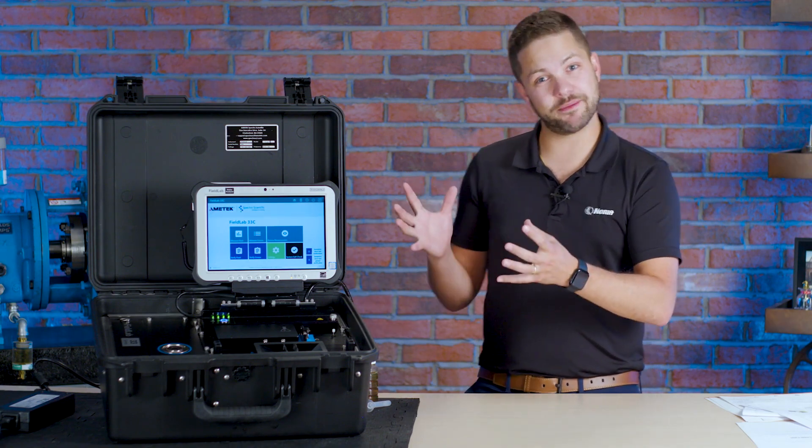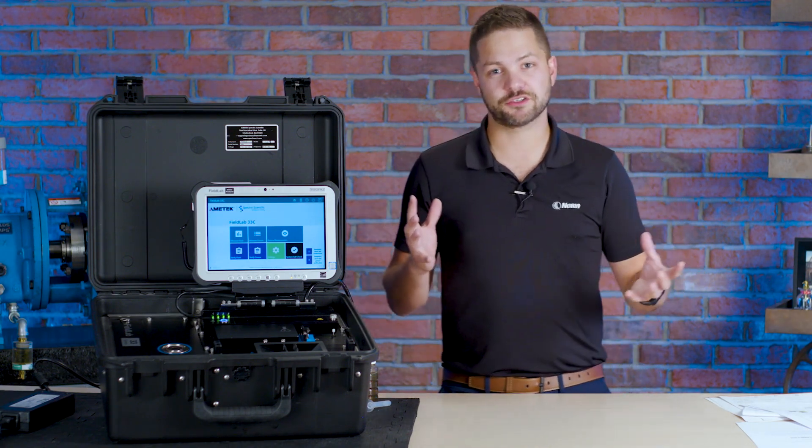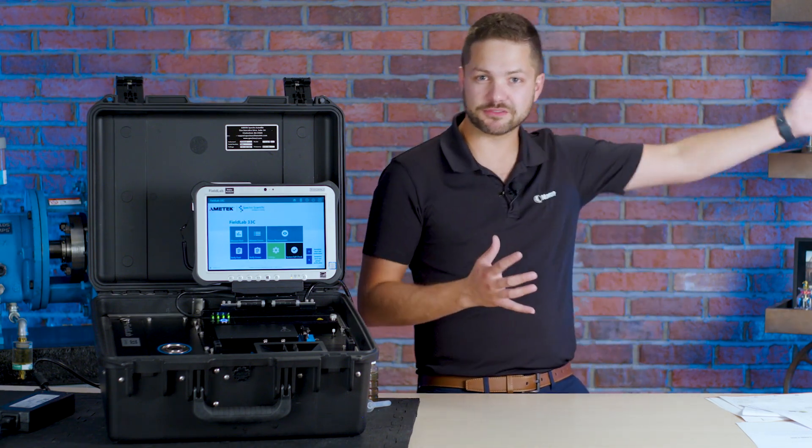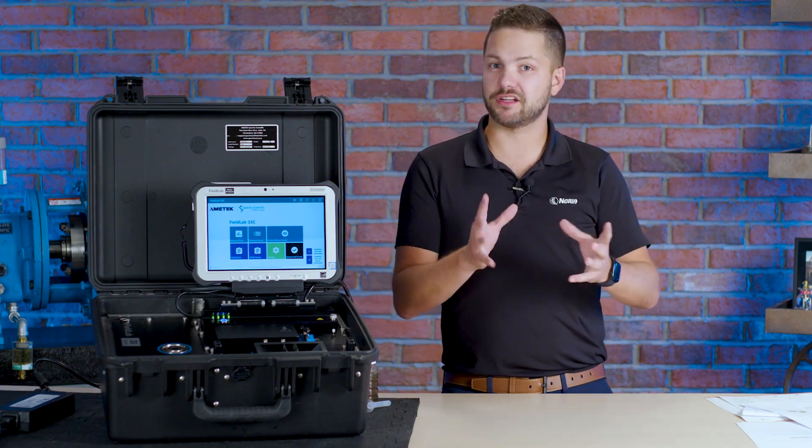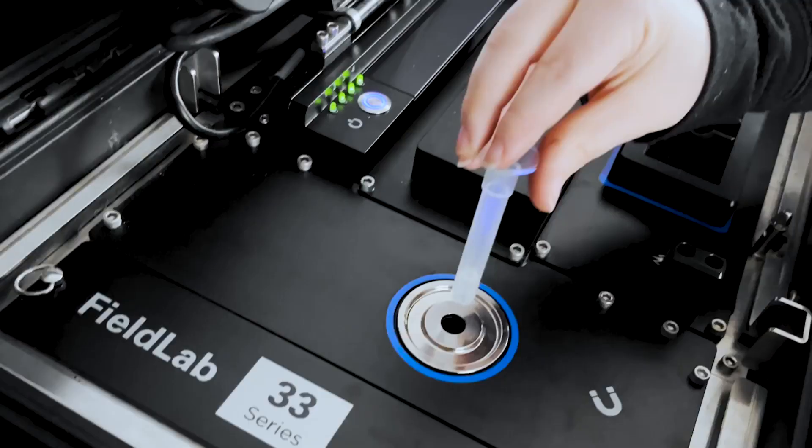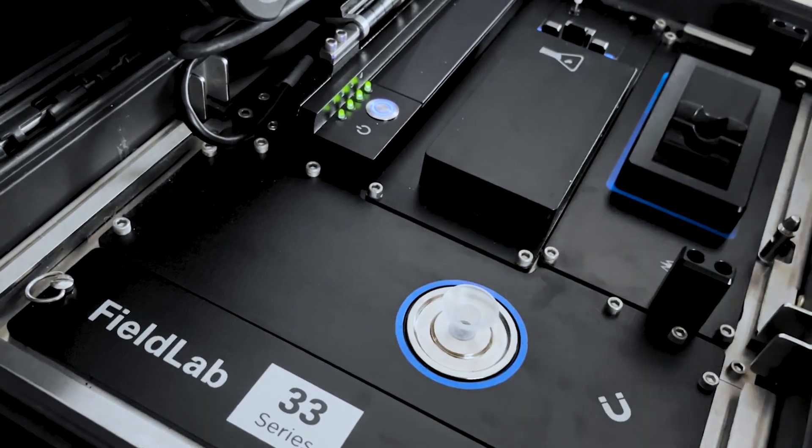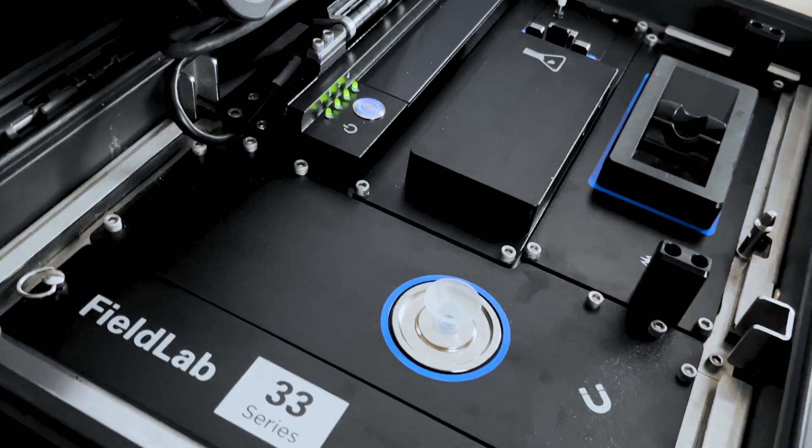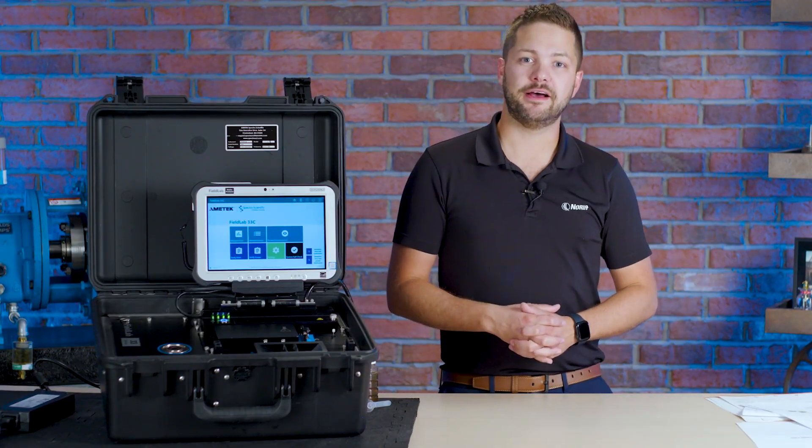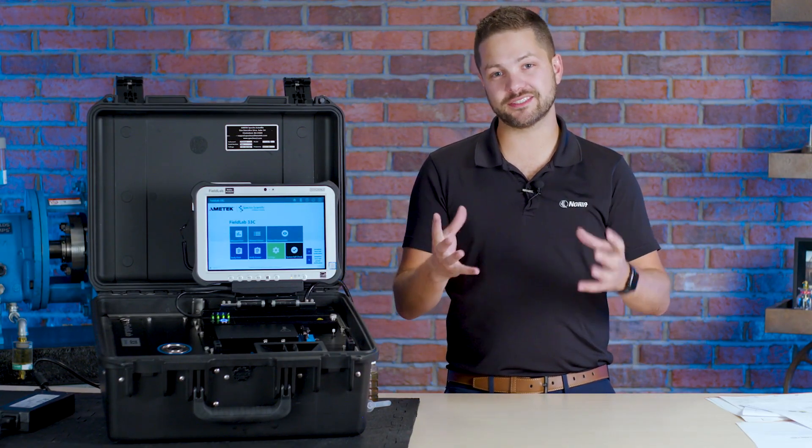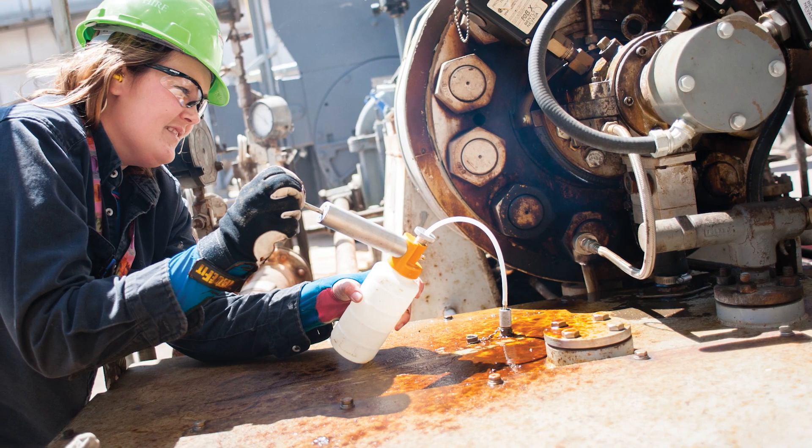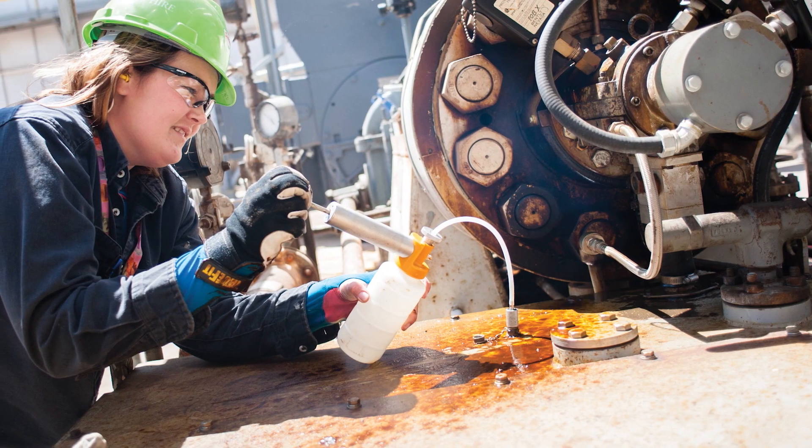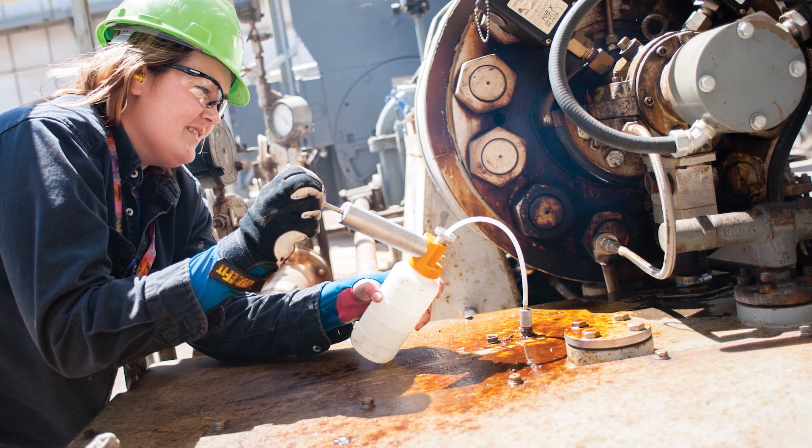This is basically the same thing but for any machines. So rather than sending samples off to a laboratory, which has a lot of value and we still need to understand the importance of that, but having the ability to do oil analysis at your machine with the Fieldlab presents you a chance to make quick decisions based on the right information right there and then.